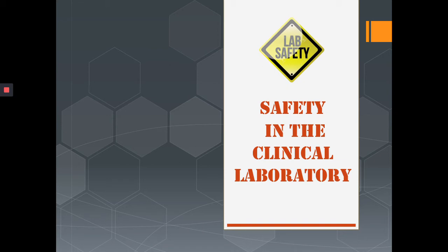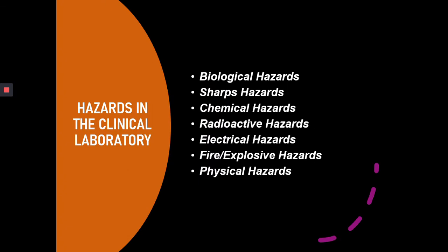Before we proceed with the different activities that we have prepared for this semester, let's talk first about safety inside the lab. It's because as medical technologists, we are always exposed to different types of hazards. This is also to ensure not only your health and safety, but also the health and safety of your co-workers in the laboratory. These are the hazards that are found in the clinical laboratory.